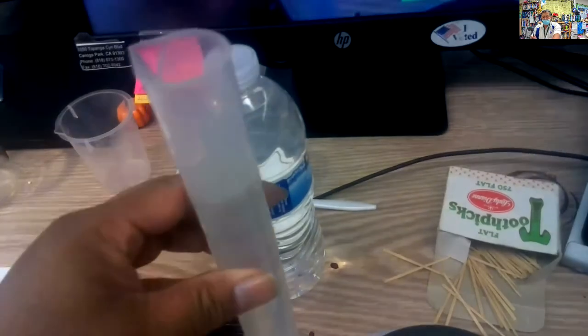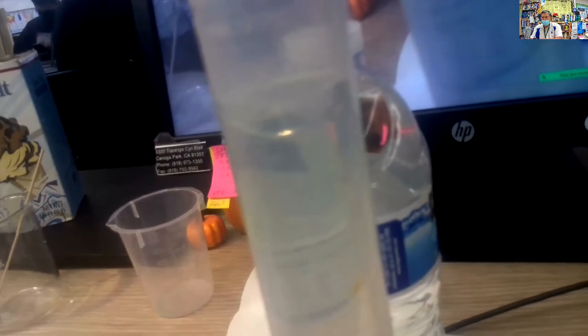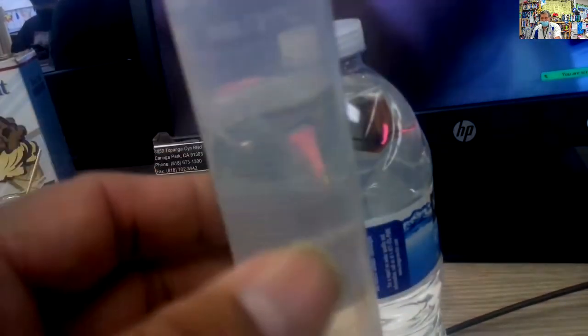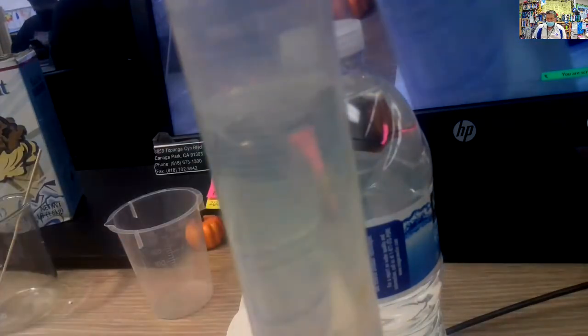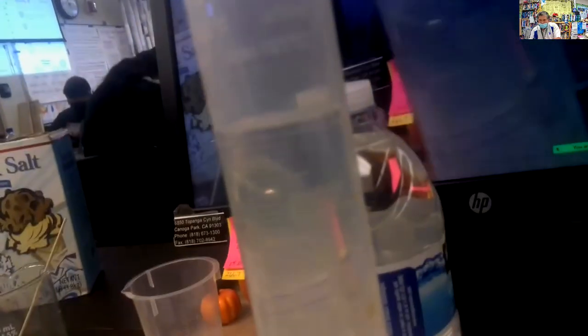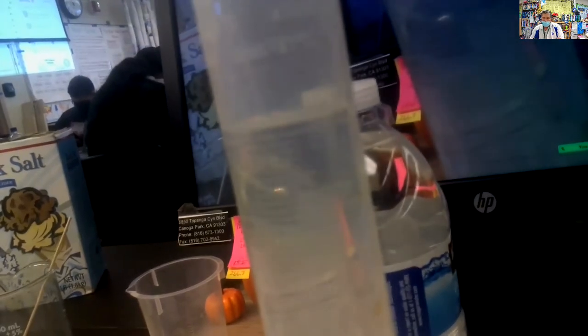It's hard to see with the plastic, but I'll try to show it to you right there. Okay, let's focus it. All right, and as you can see, the bottom of the curve of the liquid, it's called the meniscus. The meniscus should be hitting the 100 line. And that's pretty close, about as close as I'm going to get it. And yeah, I think we're good to go.